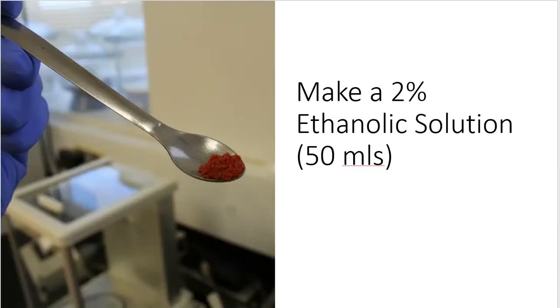All right, so 2% of an ethanolic solution. I looked at this and I said, well, okay, 50 mils. 50 mils, I'm making a little bit more than what I need, but I'm not being too wasteful at the same time. So 50 mils of this. So this is how we do this calculation. 2%, you have purchased a $150, $160 calculator. It does not have a percent key.